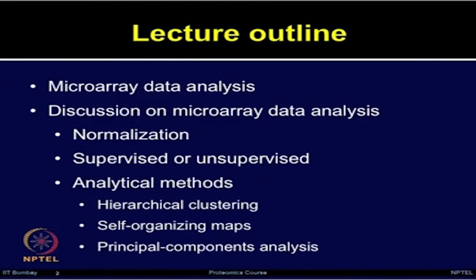We will have a discussion on microarray data analysis to cover various types of concepts such as normalization, supervised or unsupervised analysis, different types of analytical methods such as hierarchical clustering, self-organizing maps and principal component analysis.